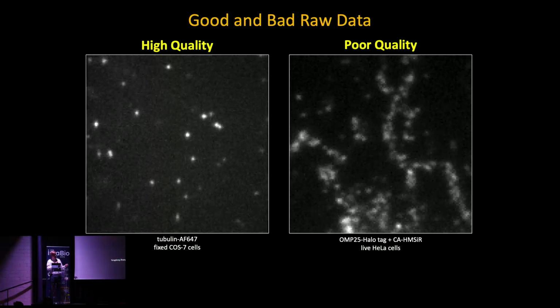In fact, you create a bias: these individual molecules outside the background are more easily localizable than the ones on your actual target, because these are nice isolated molecules, while here, where the molecules are very dense on the mitochondria, you need to exclude most of them in the localization process.